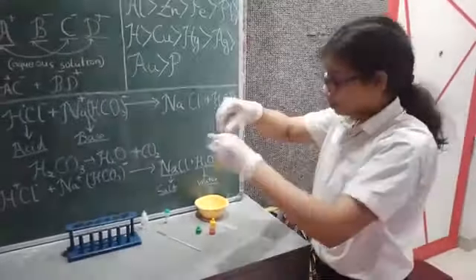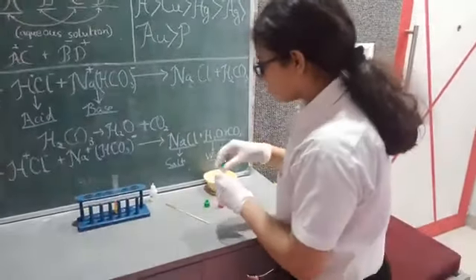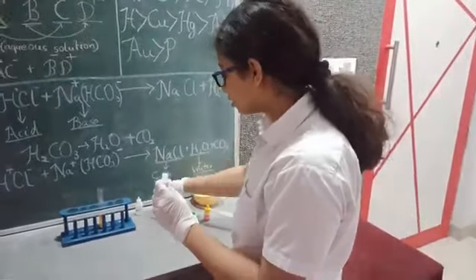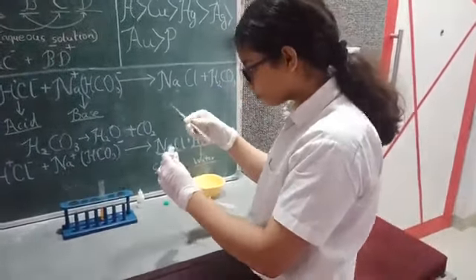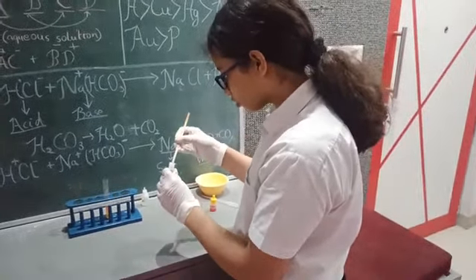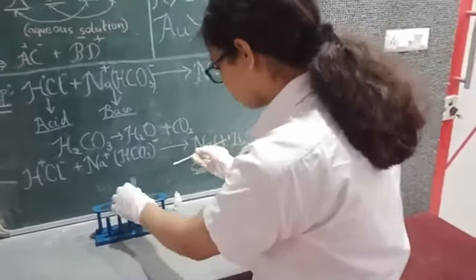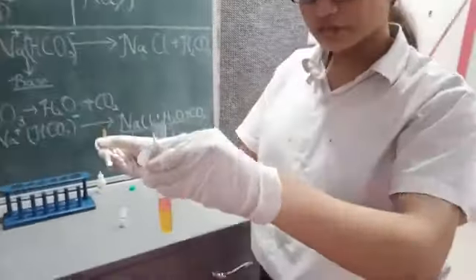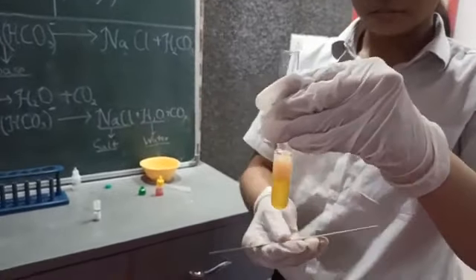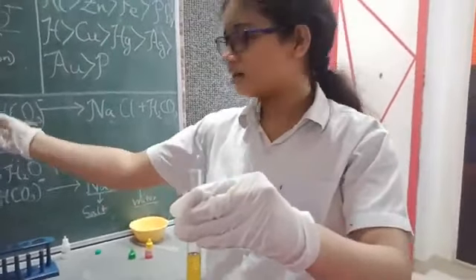And now again, when we add a little bit of base, it will again turn yellow because the base will take over the power of the acid. Right now I will show you. See, it's reddish now, but when I add the base, it again turns yellow because the base has taken over the power of the hydrochloric acid.